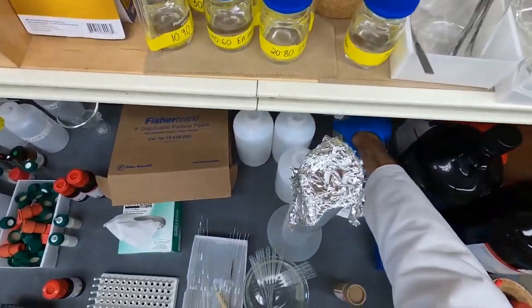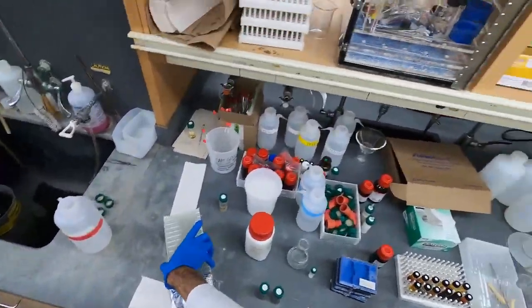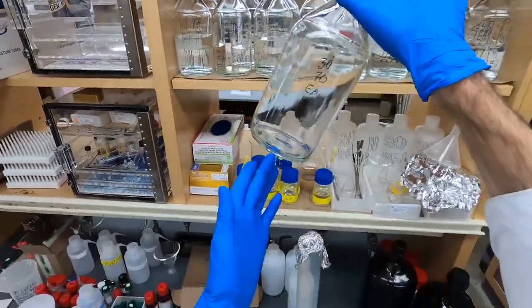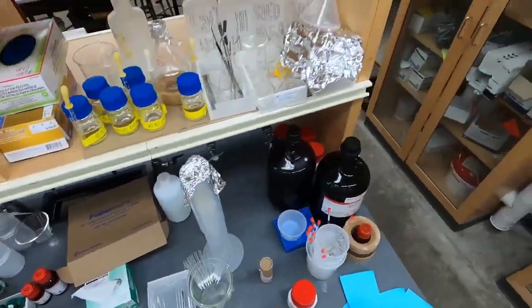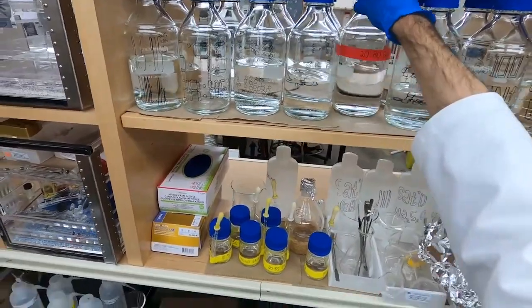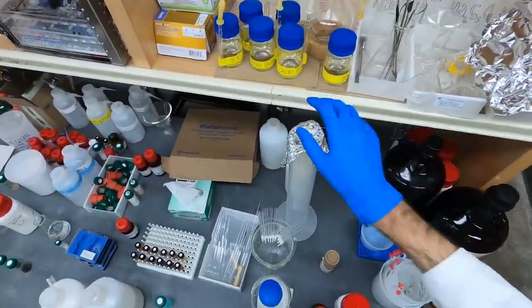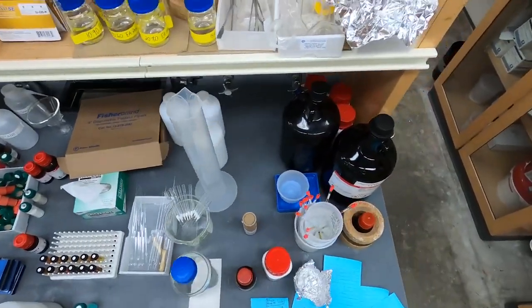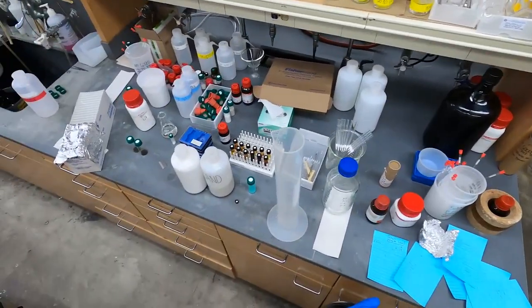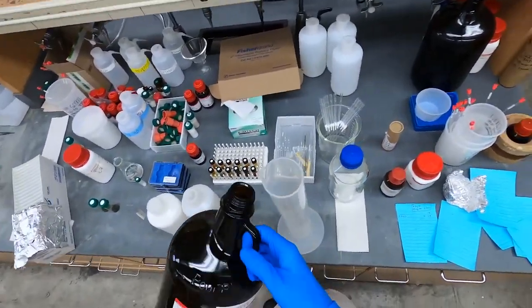I will check my stock here of test tubes. It looks like I've got plenty. I will check my eluents. So if I do end up using 30%, I don't really have much there, so I'm going to have to make some of that. I do have some 20% here if I need that, and I've got some 40%, already made. I might make up a batch here of 30%, just because I'm guessing I'll probably end up using that one, based on what I've seen so far.